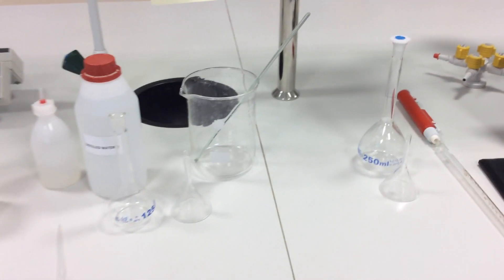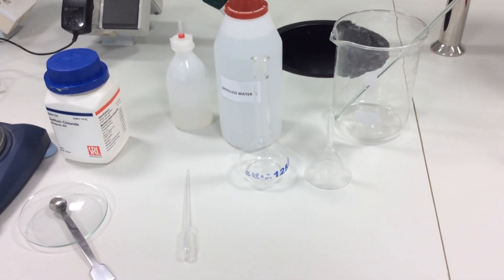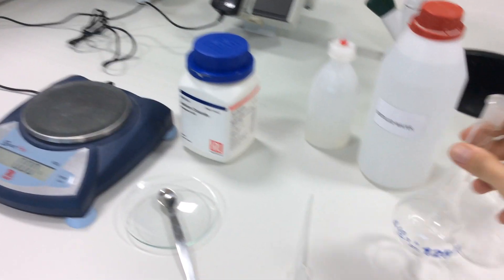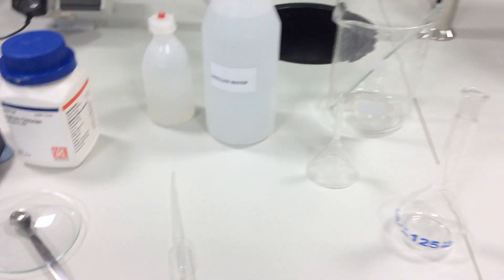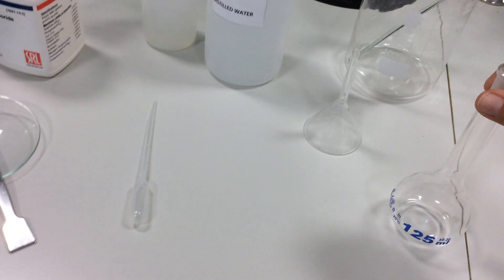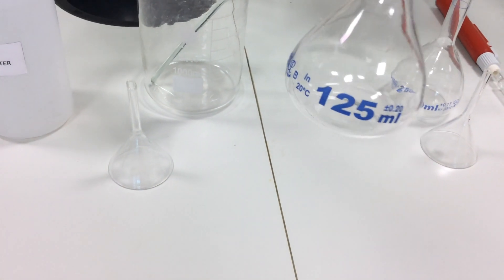We are here to prepare 0.1 molar NaCl of 125 milliliter solution. After we did our calculation, it turned out that we need 0.73 grams of NaCl. Here on my bench I have a volumetric flask of 125 milliliter where the solution will be prepared.